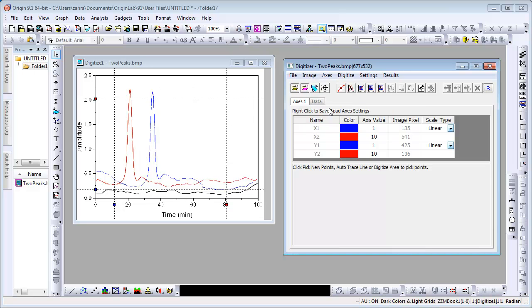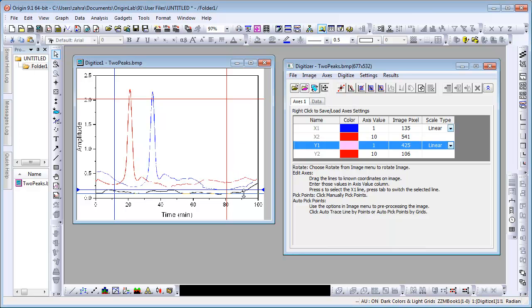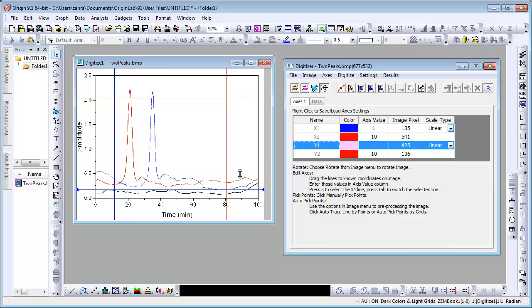Next, we set the axes on the image so there is a reference for calculating the XY coordinates. Click on the Edit Axes button. Align these four lines to known values on the axes. For example, we can set Y1 to 0 or 0.5.